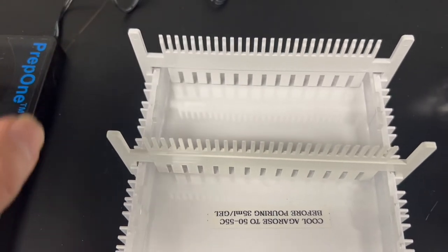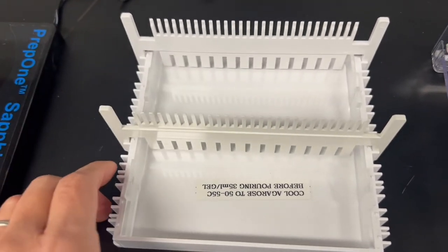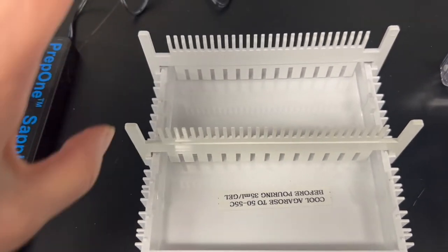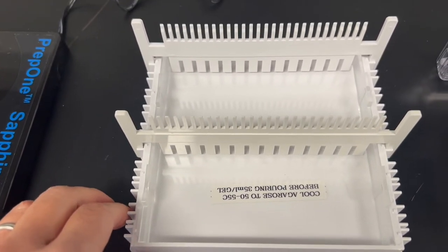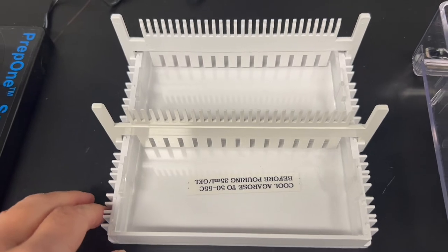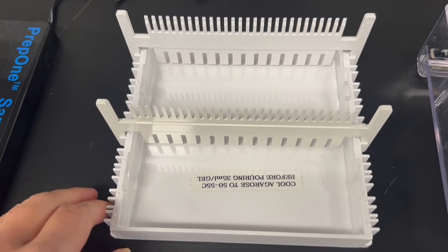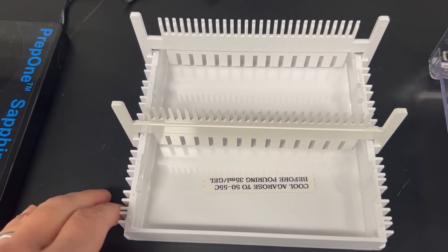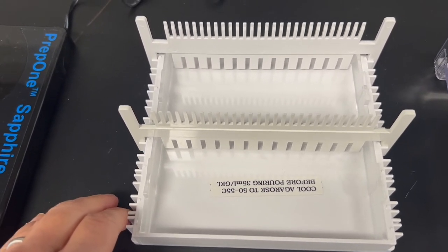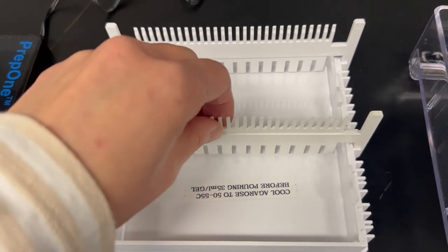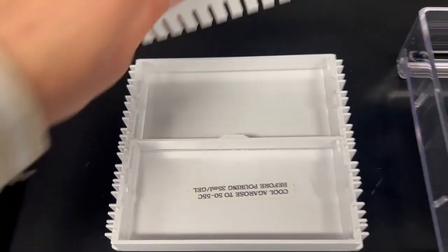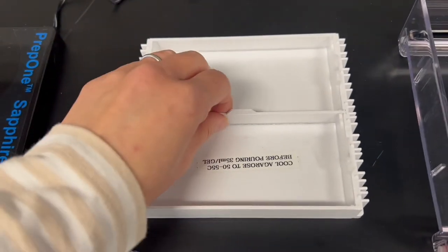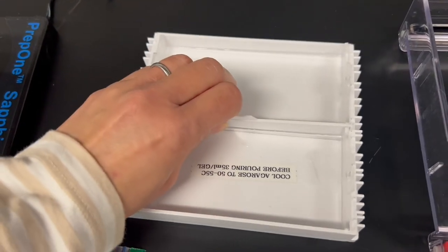And then I pour the warm agarose mix in here. Make sure you just follow the directions. Temperature is really important. Just be patient.